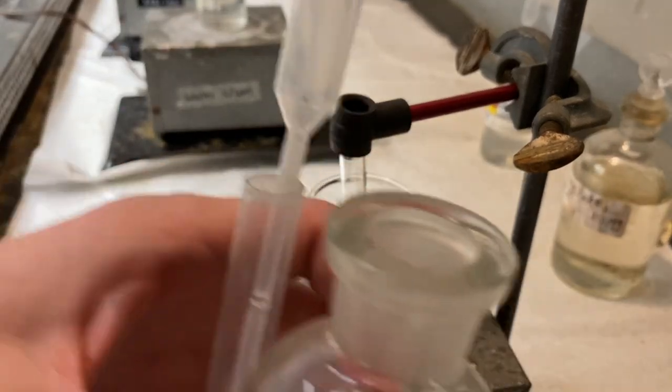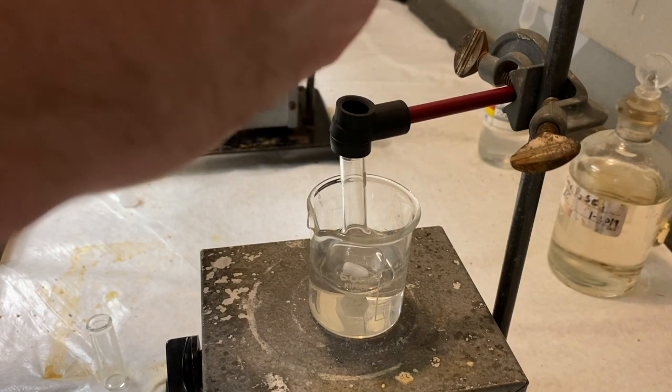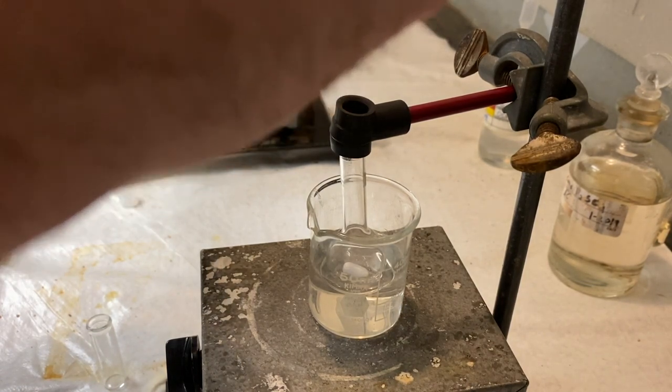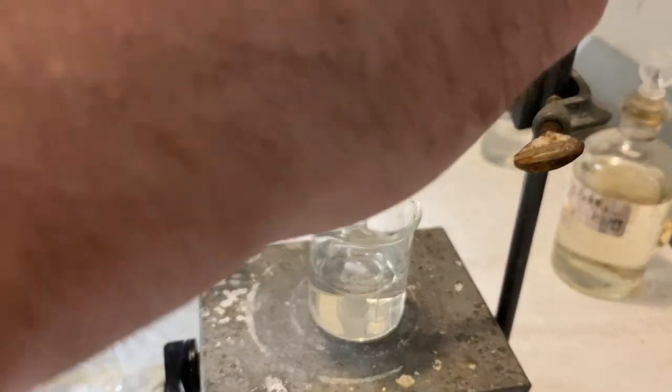So I'll just use the pipette here to measure it. Since this part is not necessary to get it super accurate. There's the nitric acid.